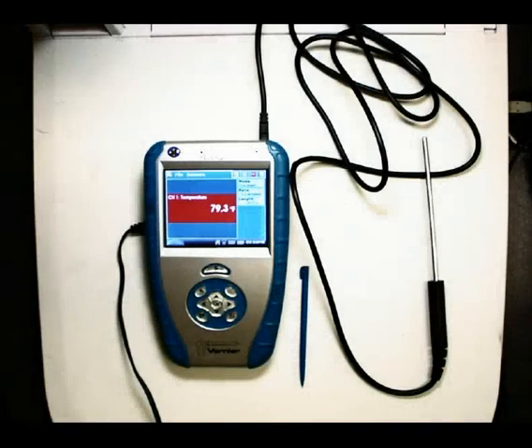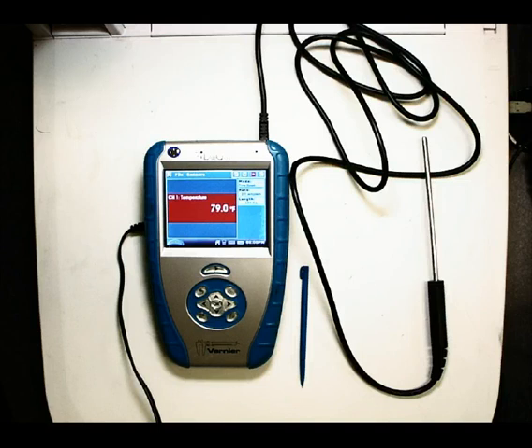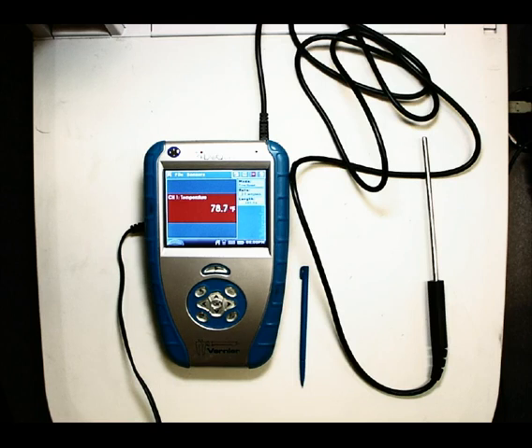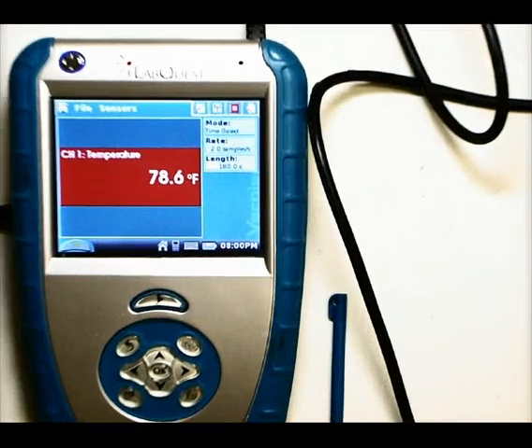Hello everyone. Here we have a LabQuest and it's connected to a sensor — in this case a temperature sensor. What we're going to be looking at is how to set up the LabQuest to collect data for us. If we're using a thermometer and we want to collect data, we're probably going to be recording how long the thermometer has been in there and what temperature it reads. The LabQuest will do both very easily and very accurately.